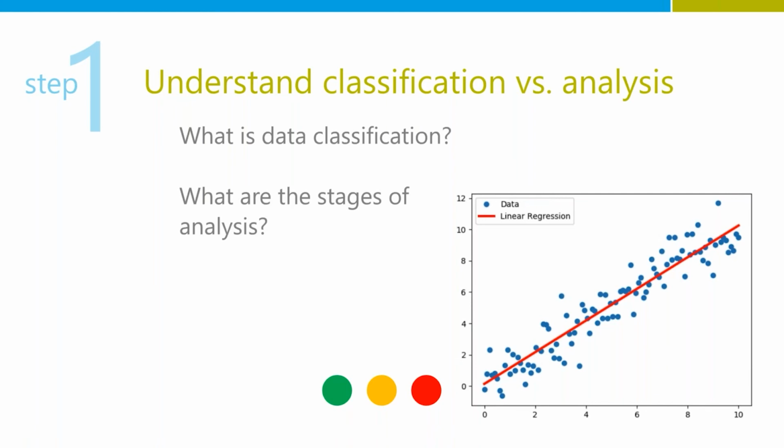So let's start with the data classification level. Data classification, in my mind, is a way of looking at the individual data points that you have within a given test set. So for example, if you have a test that took place on a given date and it contains 10 data points, you'd look at those 10 data points individually and apply a classification to them. This classification is, in a way, its own sort of type of analysis just on that individual data point.